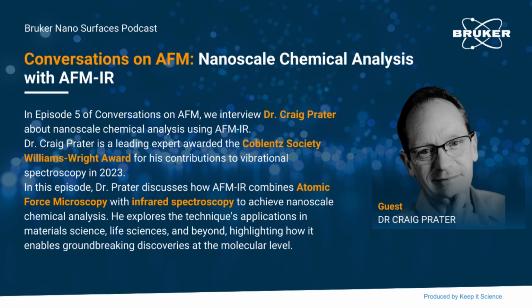And so the big advantage of AFM-IR was that it was able to provide a measurement of infrared absorption with a spatial resolution not limited by the wavelength of the infrared light, but rather by the size of the AFM tip. Basically enabling spatial resolution to go down to the scale of 10 to 20 nanometers, in some cases smaller than 10 nanometers. Which is what we all love. We all love good resolution, absolutely.